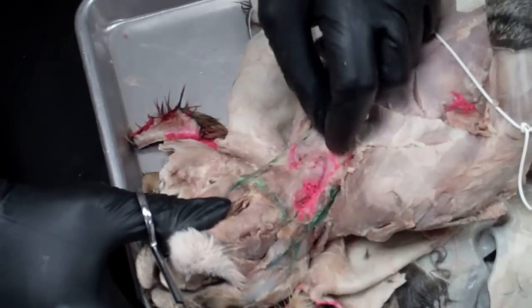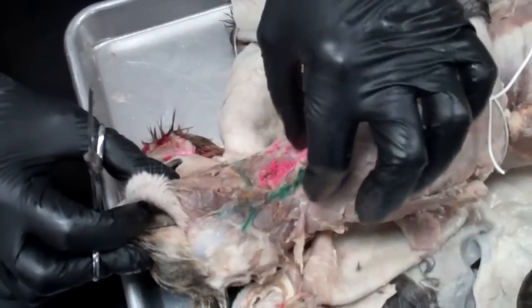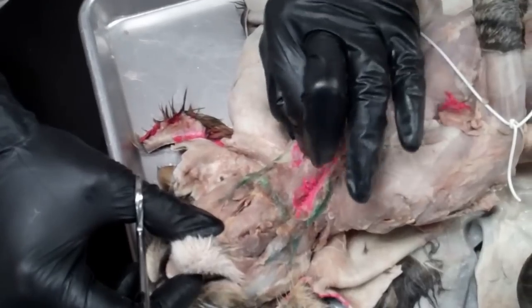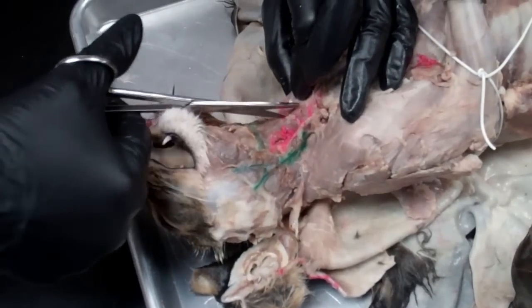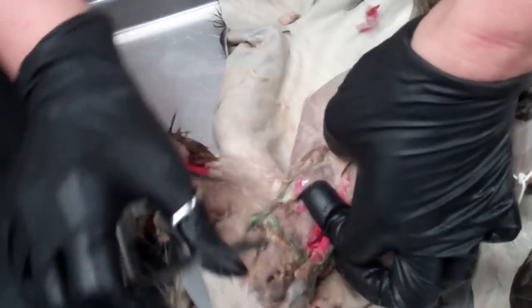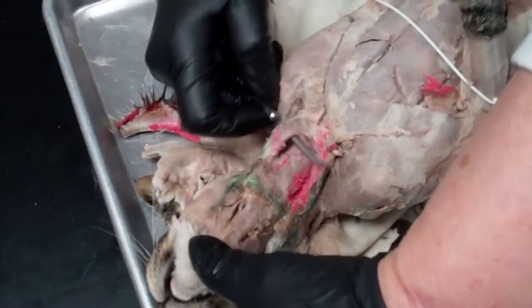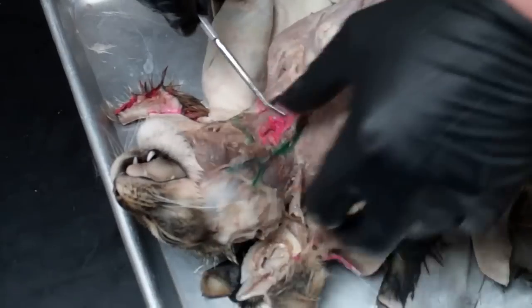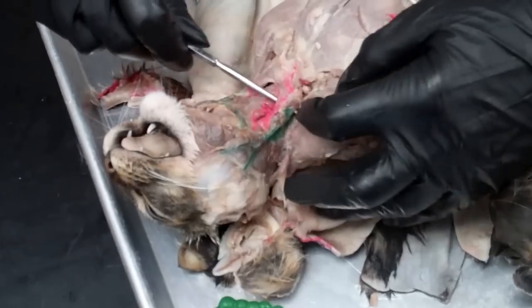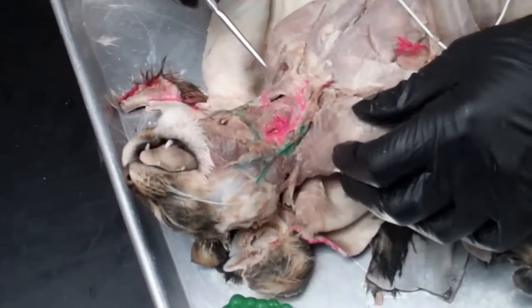The sternomastoid is a muscle on both sides of the cat that runs right underneath the jugular. Depending upon the injection, it may be a little bit more difficult to find, but you should be able to find the natural separation and get underneath it. This would be the sternomastoid on this side, and this would be the sternomastoid on the other side — that's what the cat uses to turn its head from side to side.